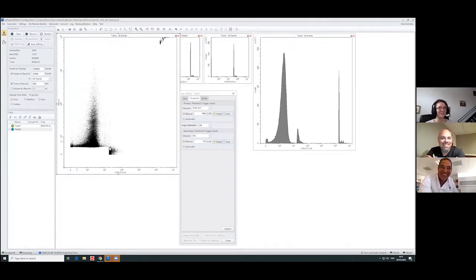Okay. And again, it depends on your sample preparation, on the theory and scattering properties of your samples. We are not talking about size, we are talking about the scatter and the population that we can see. So I always want to see a little bit of noise. That's my opinion. I want to see the noise to see what else is coming and where my limit is.